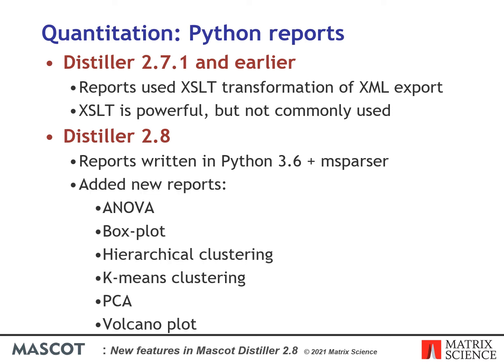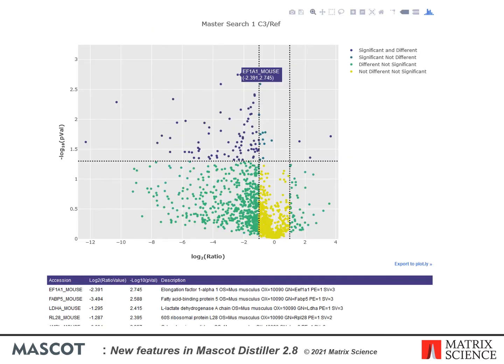We've taken the opportunity to add some new reports to Distiller, so you'll now find options to generate ANOVA, boxplot, various clustering reports including PCA, and a volcano plot. Here's an example of the volcano plot report for one ratio of a label free dataset, exported using the interactive JavaScript option so that hovering over a point on the graph displays the associated protein accession. This information is also presented in the set of tables below the graph.